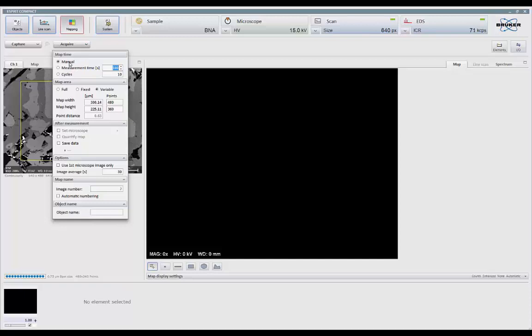I can do it for time or number of iterative passes. I also can do a subset of the original image, or I can tell I want to do the full area. When I'm done with these analysis, I can have it automatically save the results.